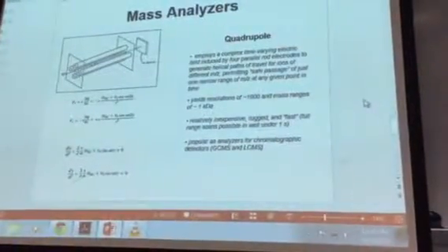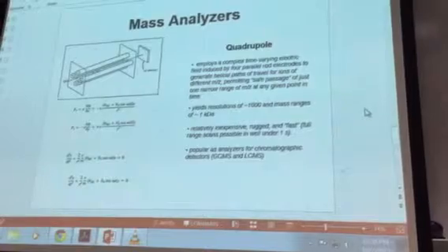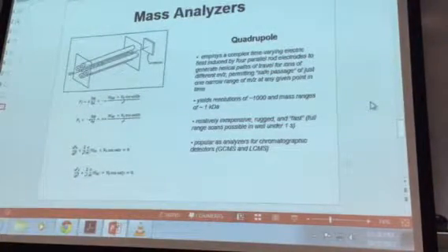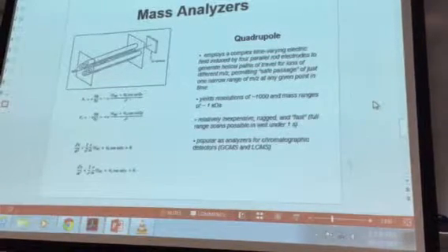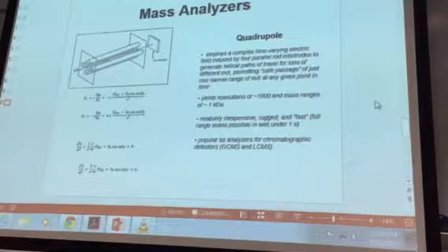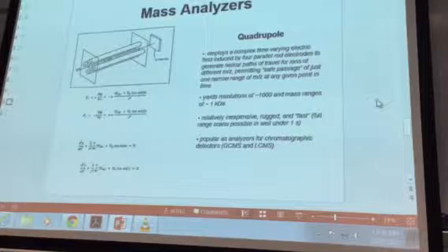These are super popular. We have 1, 2, 3, 4, 5 mass spectrometers downstairs in our instrumentation suite. 2 of them are, what's the word, dedicated detectors for gas chromatographs. 2 GC mass spec systems we have. Our laboratory work next week, 2 teams will be working with those mass spectrometers, just ignoring the GC part of it, just working with mass spectrometers.